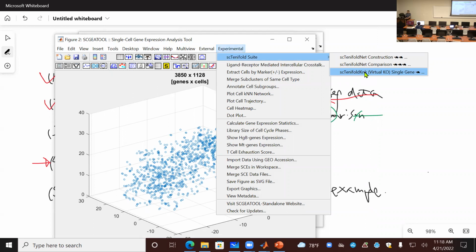Okay, my starting point of the population of cells is pure T cells. I don't want to mix up with all other cells. So the prediction will not make any sense if you have a mixed population of cells. Whether your knockout impacts B cell or T cell, we don't know. But here we have clear pure T cells, and you can do virtual knockout.